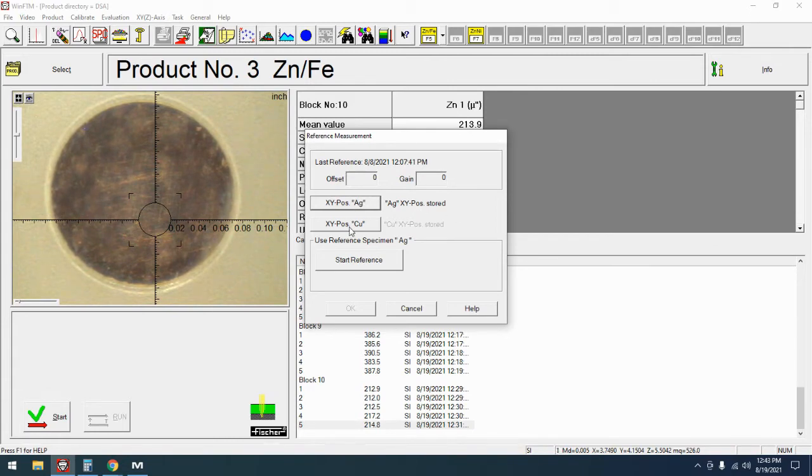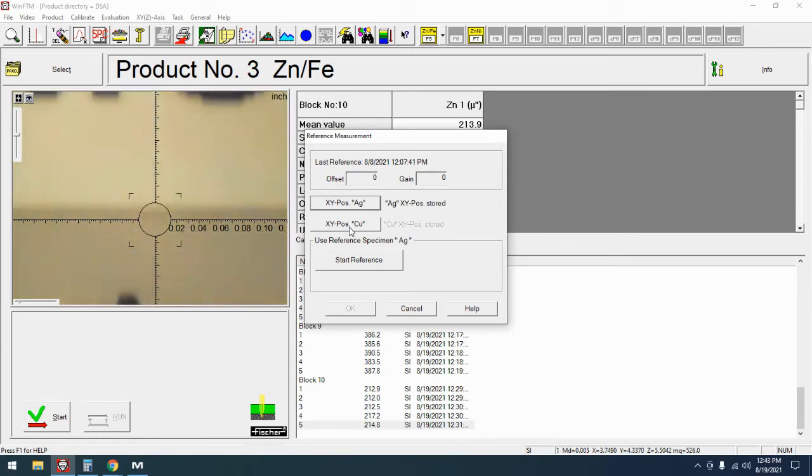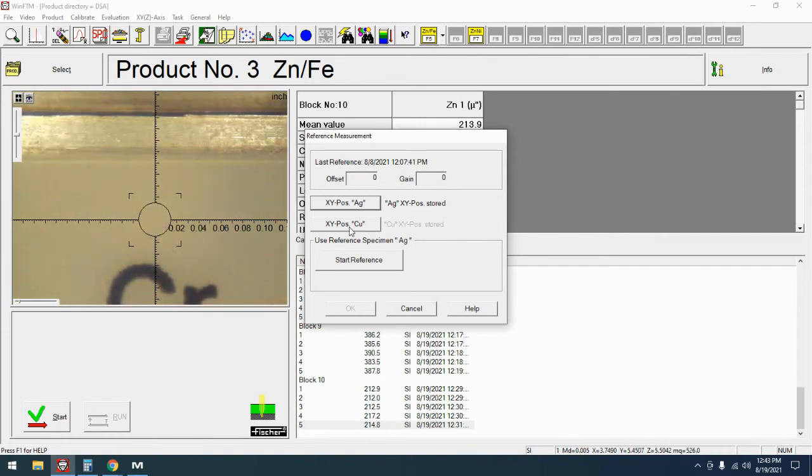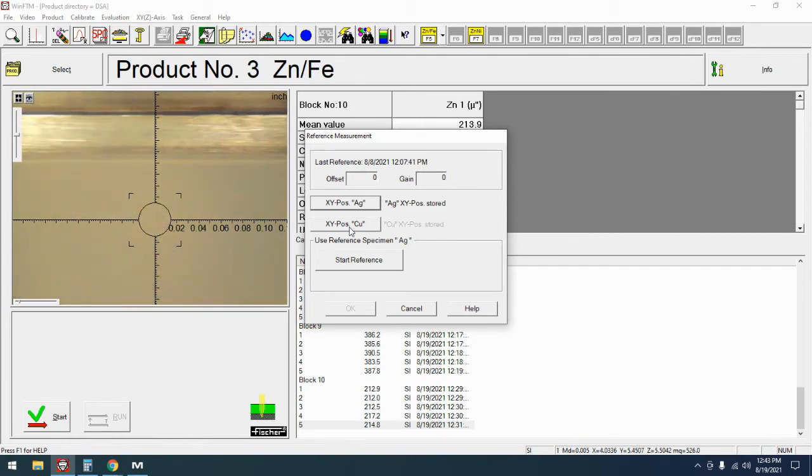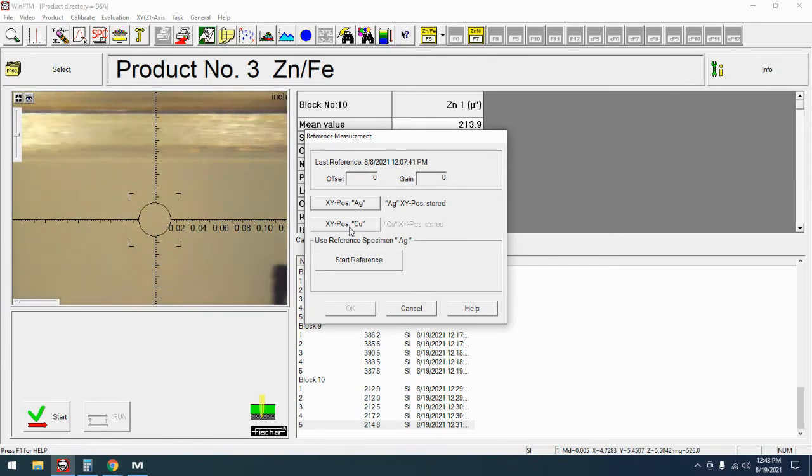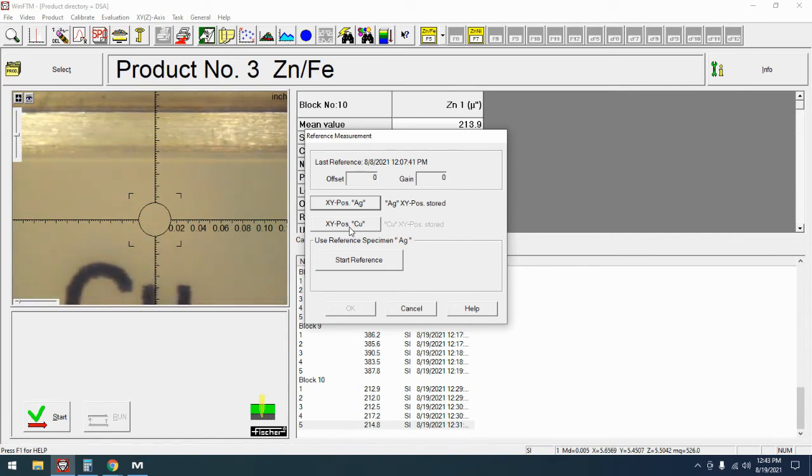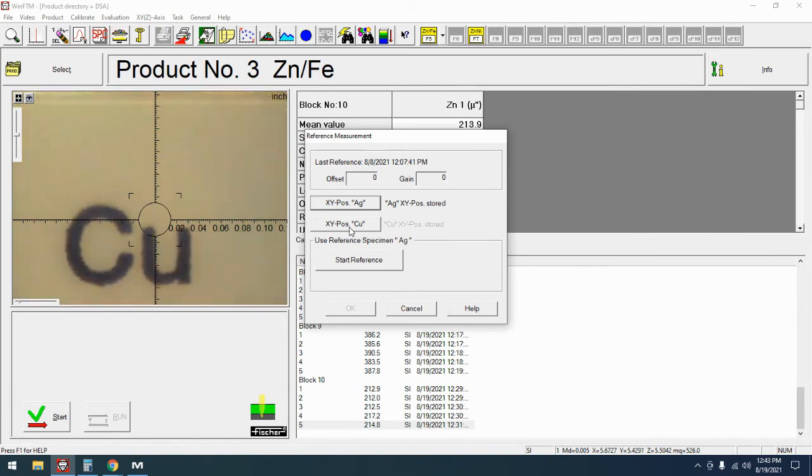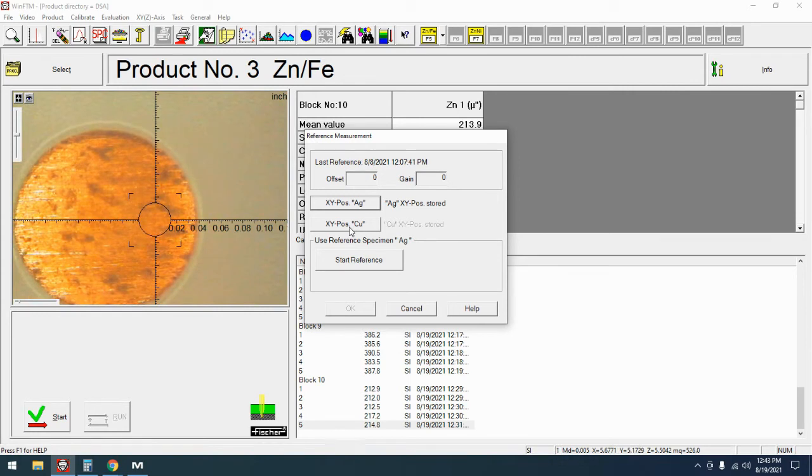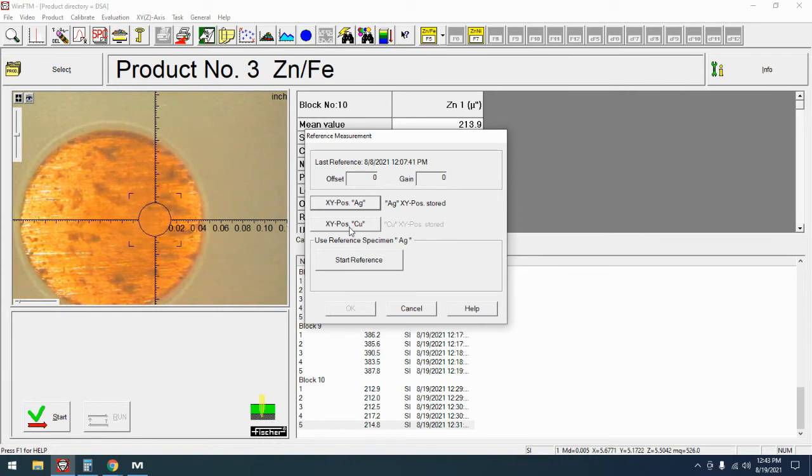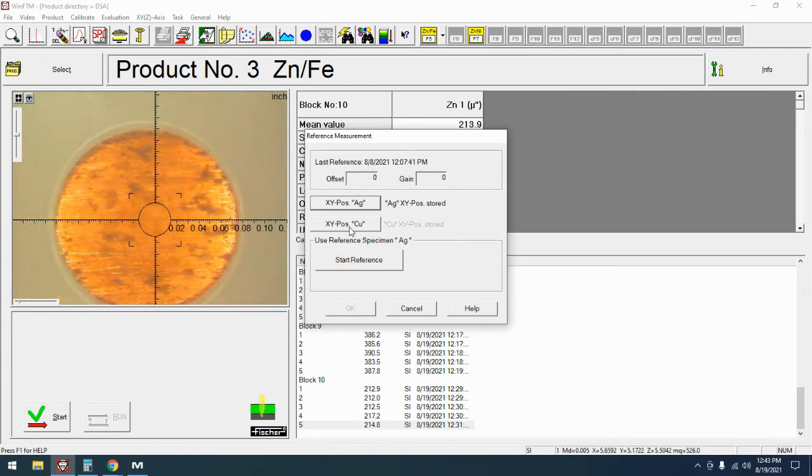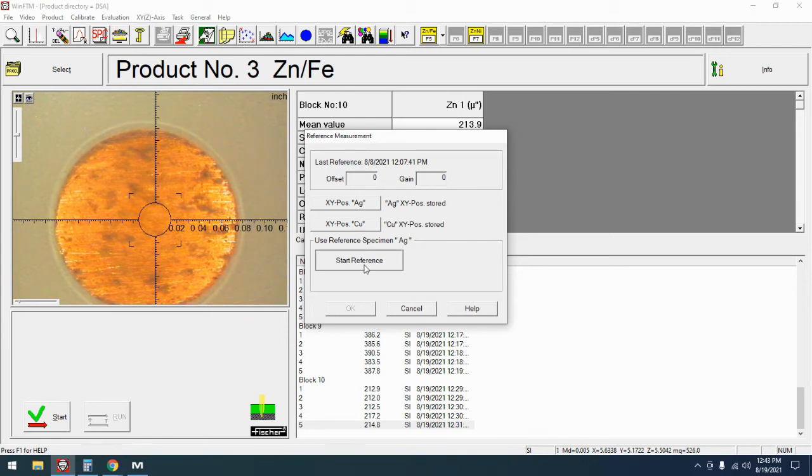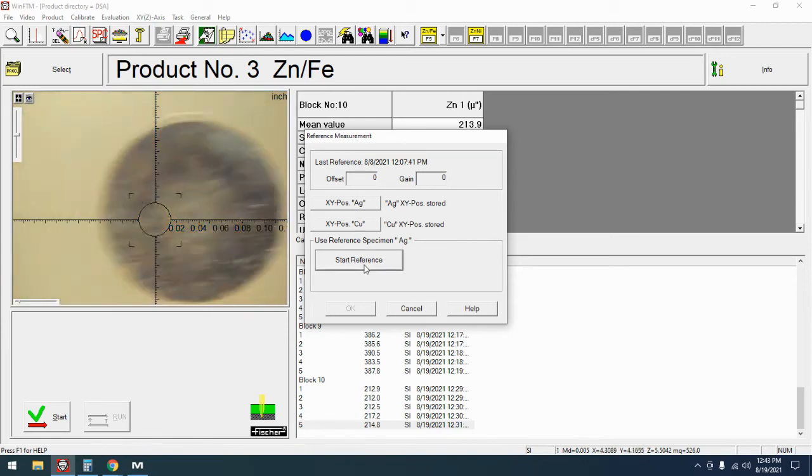Now I'm going to move over to copper. Depending on what version of the pure element card you have, copper might be right next to silver or it may be in another row farther down. So another reason I like programming it in. And we're going to hit copper X Y position and now we're going to start reference.